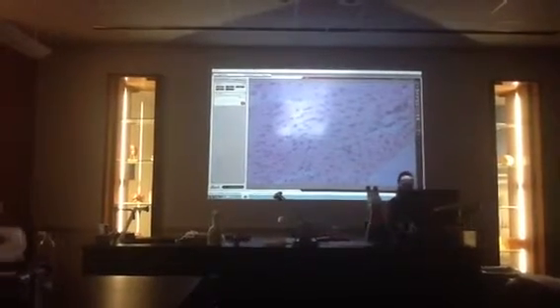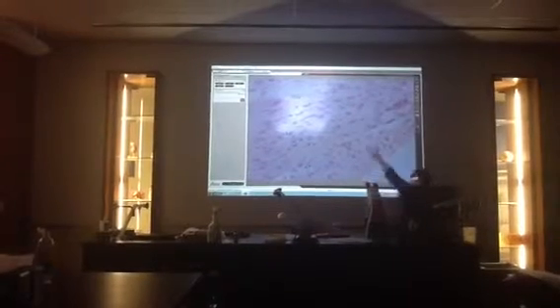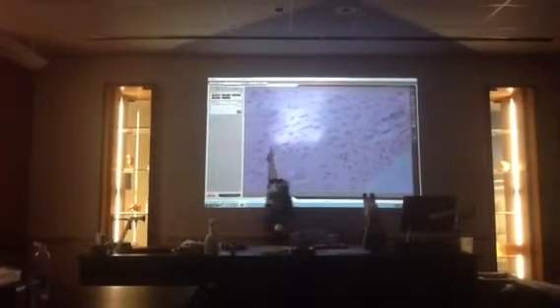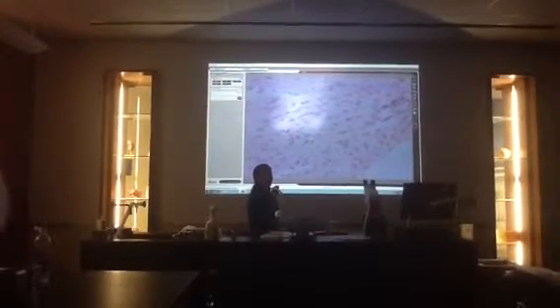Can you show me again, please? Longitudinal, right here. The longitudinal looks like muscle units. Okay, I'll look at it on this section. I got a good picture of what she's just saying. So what was all this again? Esophagus.